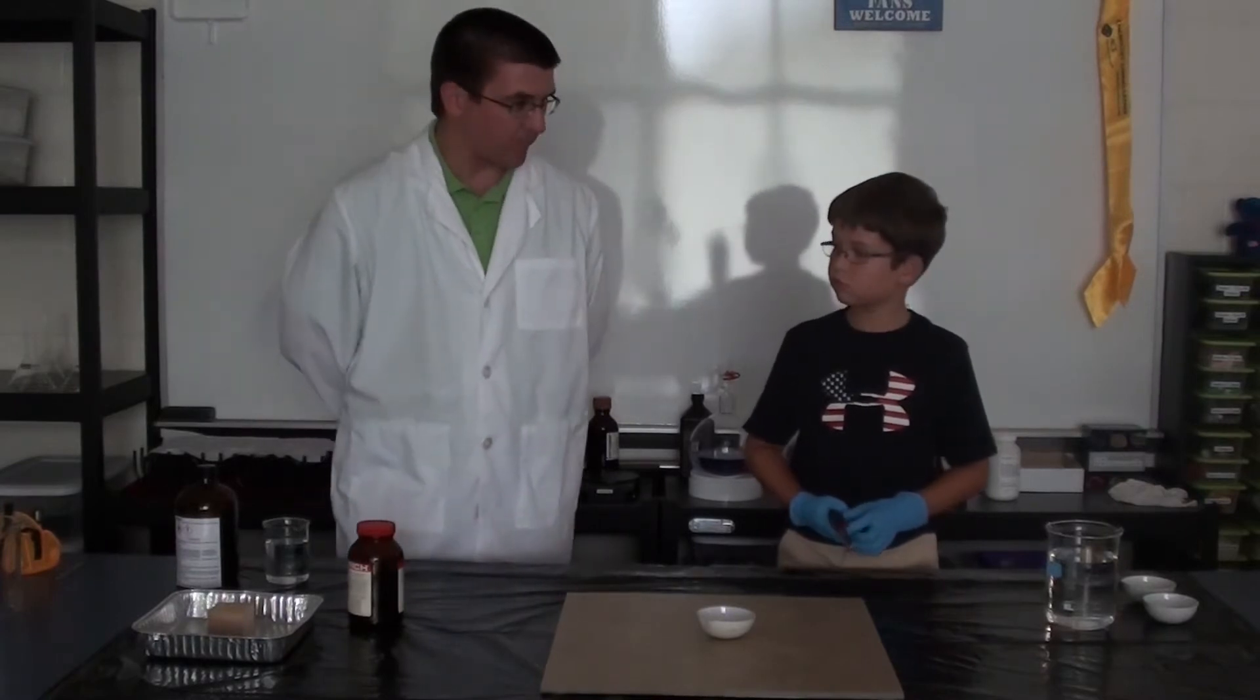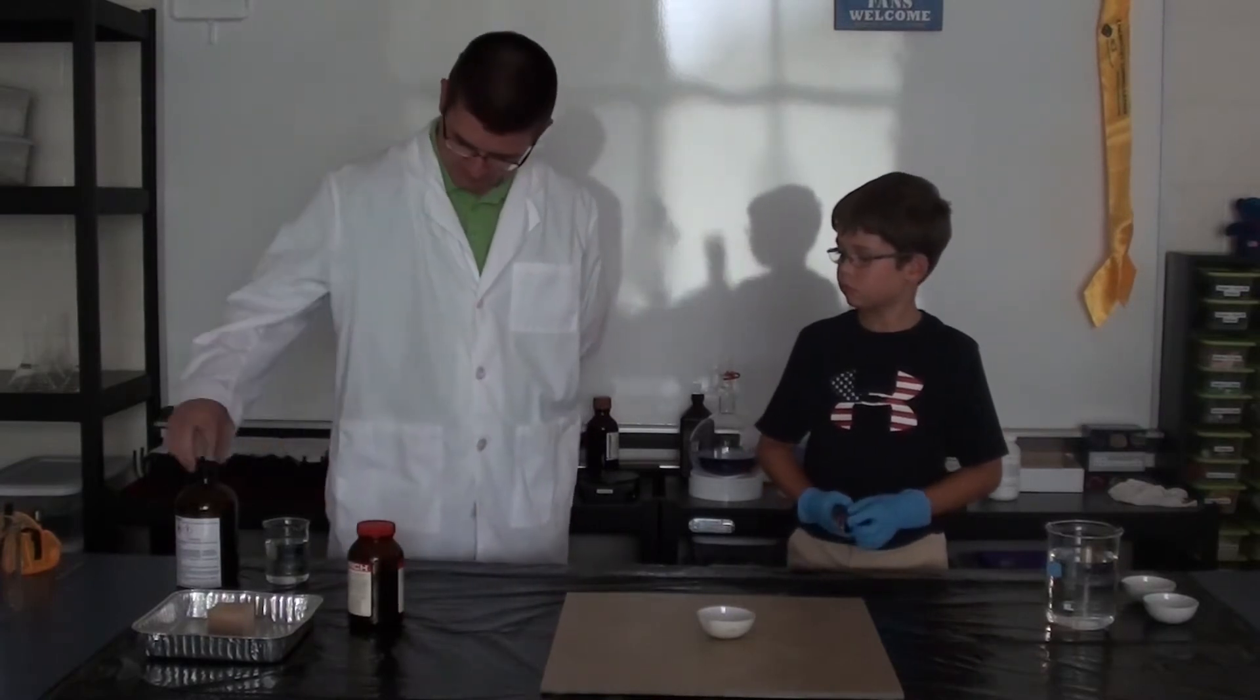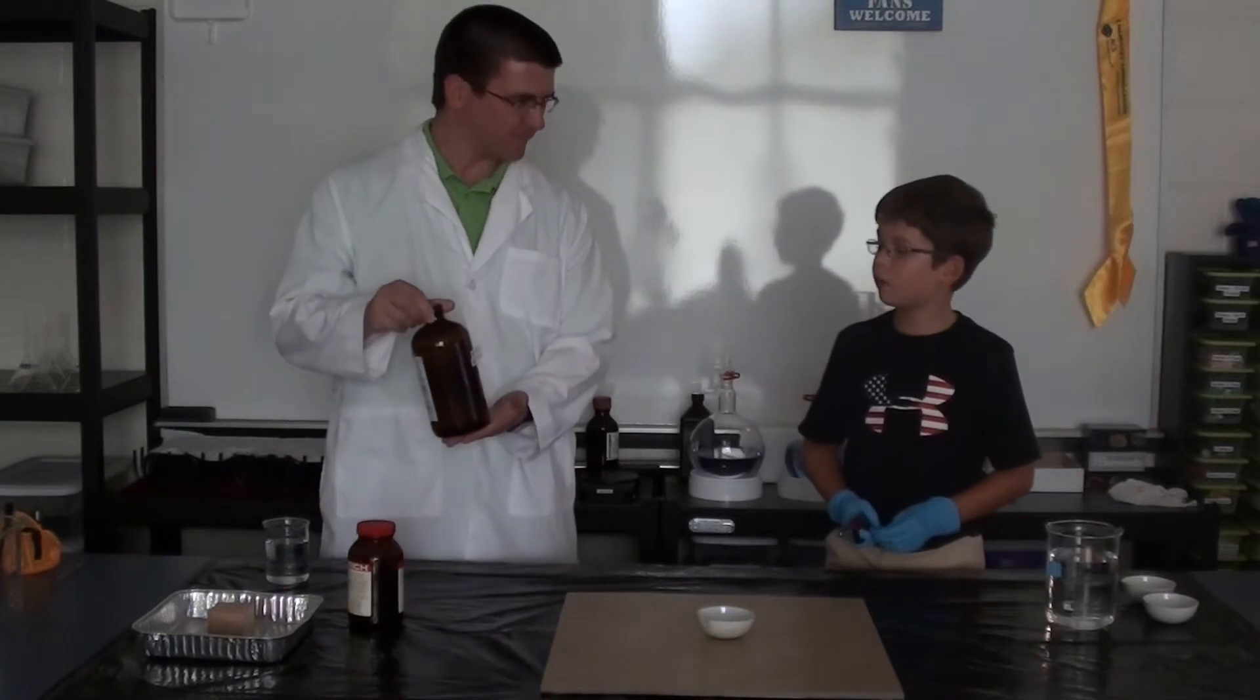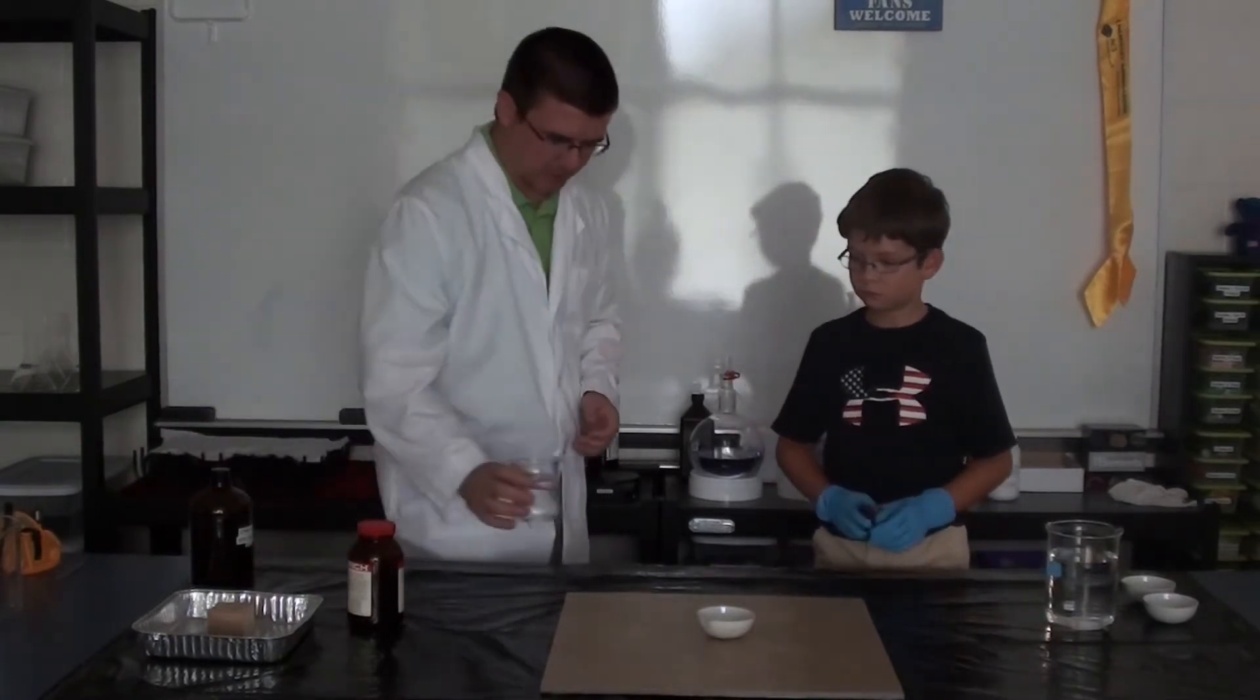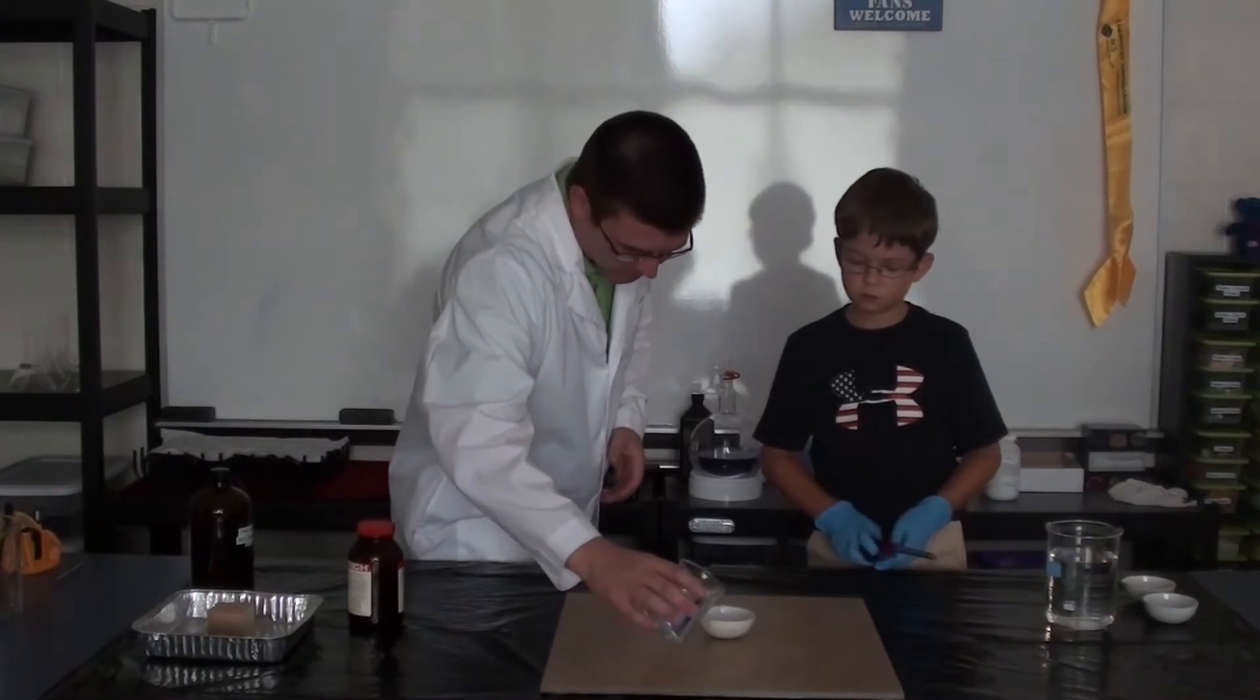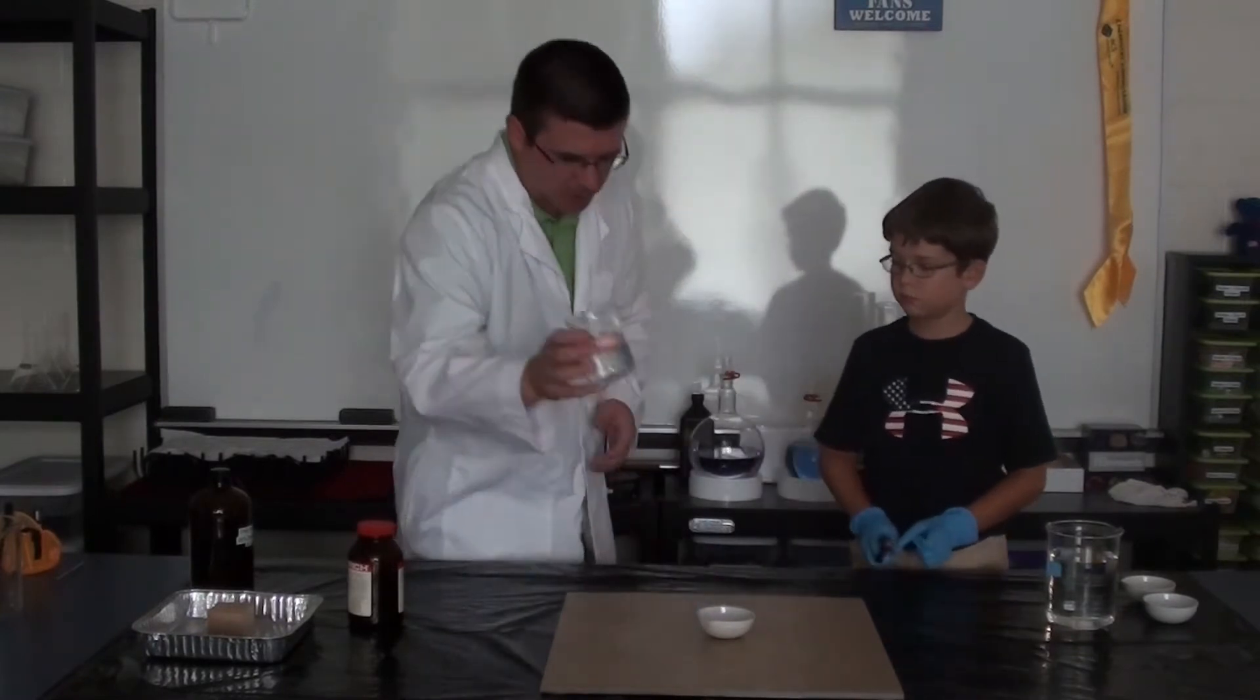Now we also need a type of fuel. We need something to burn. So what's our fuel going to be for this? Alcohol. And we're going to go ahead and pour a little bit in this evaporating dish here. It's a small amount.